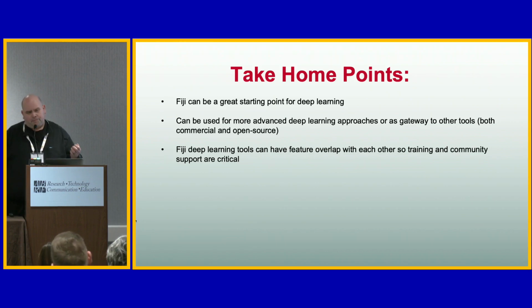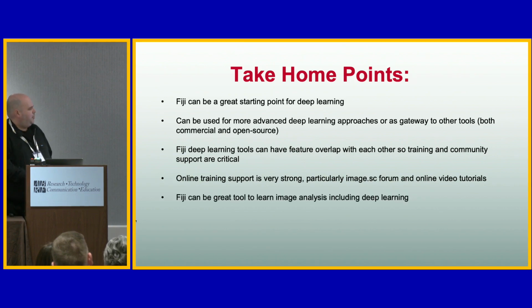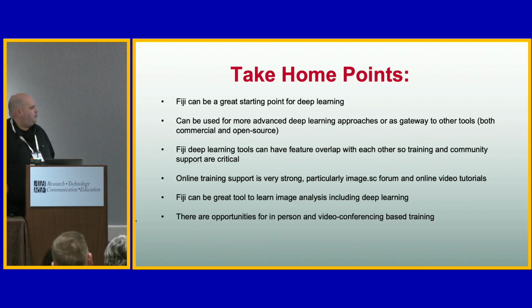If you want to know what works well, you don't have to struggle by yourself. You can ask others which tools work well and comment on the forum or other resources. Online training support is very strong, particularly the forum and some other initiatives that we're starting with Beth and others. And there are wonderful online video tutorials. It's kind of repetitive, but basically it's a great tool to learn image analysis, of course, and deep learning. And there are also opportunities for in-person and video conference-based training.